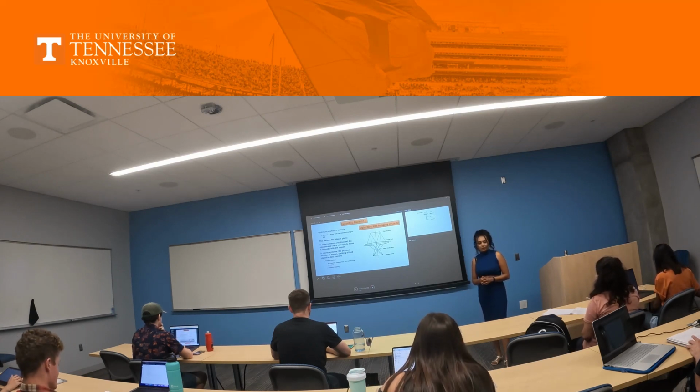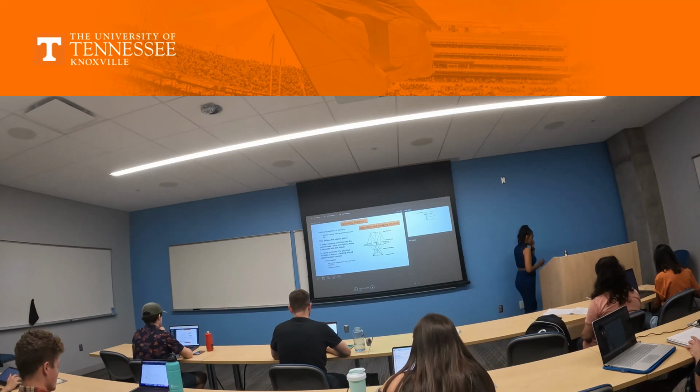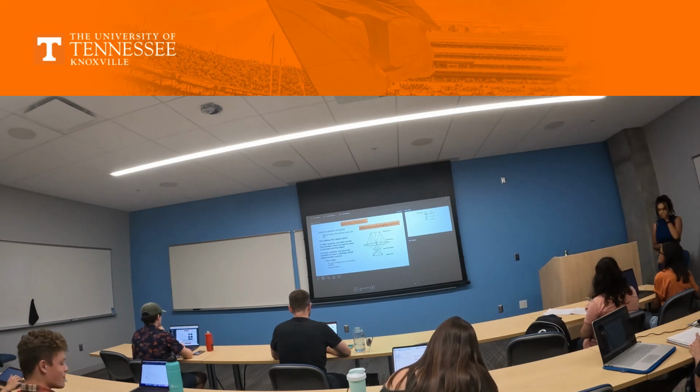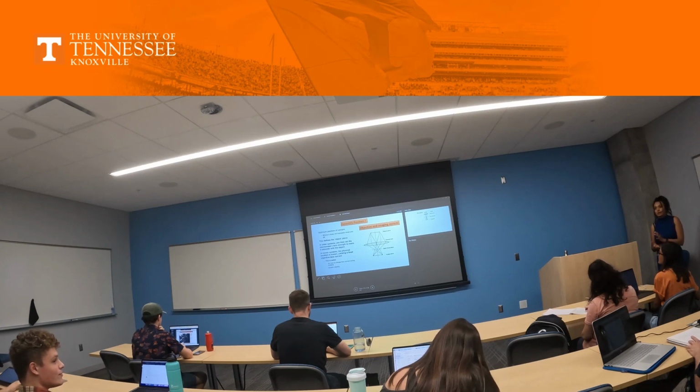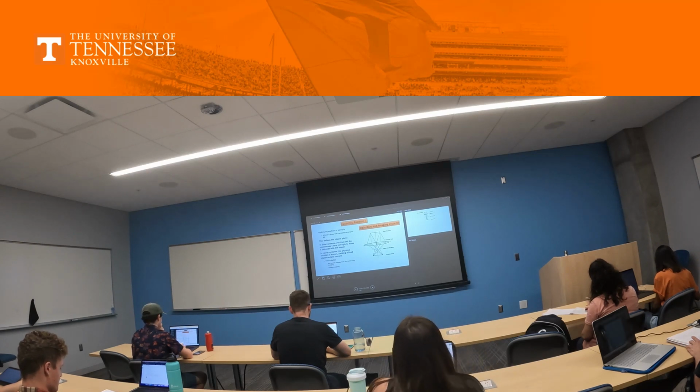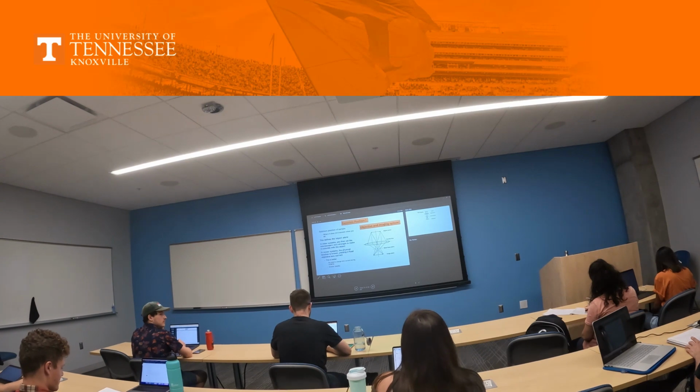And then there were C2 and C3, I think. 3 lenses, C1, C2, and C3. And with each one of them, we do a particular thing, depending on the use case, right? So C1 we use for what?